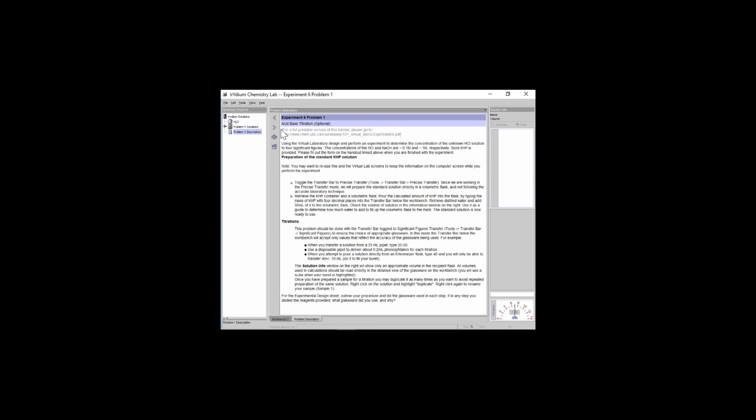Pretty much we're trying to do an acid-base titration. We're using KHP as our primary standard. That's a really pure solid that if I make a solution of that, I'm going to know the concentration really well. We're going to be doing 2 titrations using this KHP here to figure out the unknown concentration of NaOH. They help you out a little bit and they say the NaOH is going to be roughly 1 molar. But the whole point of doing a titration is to figure out, well, what's the next significant figure, 1.1, 1.12? I want to know more digits there. Once I have standardized the NaOH, I'm going to use that solution to standardize HCl.